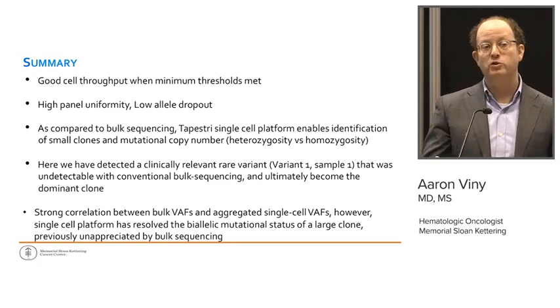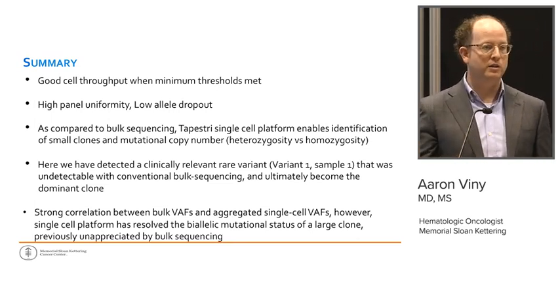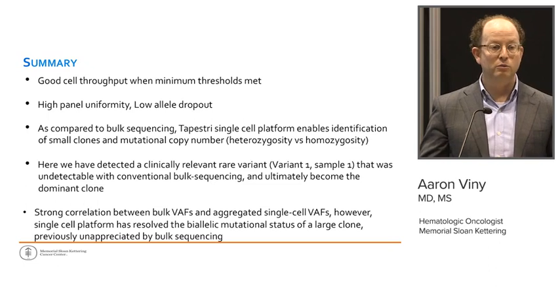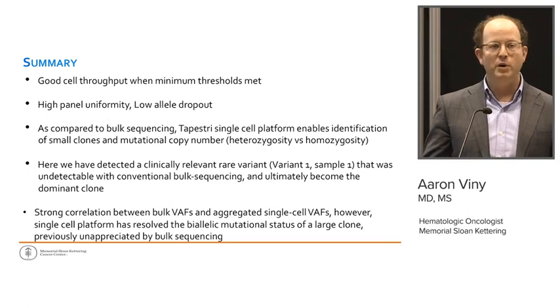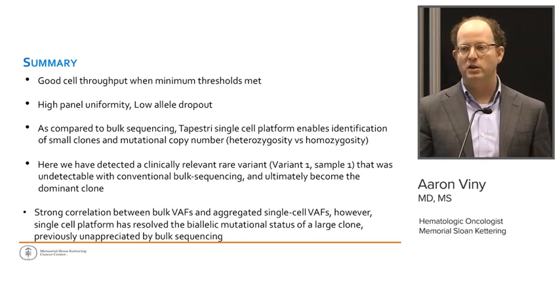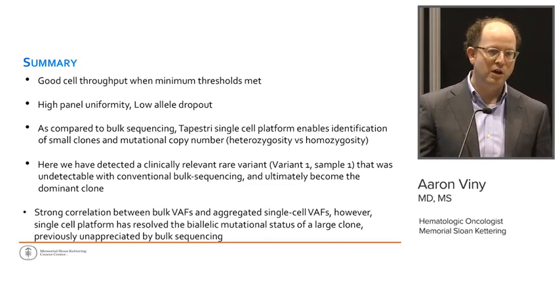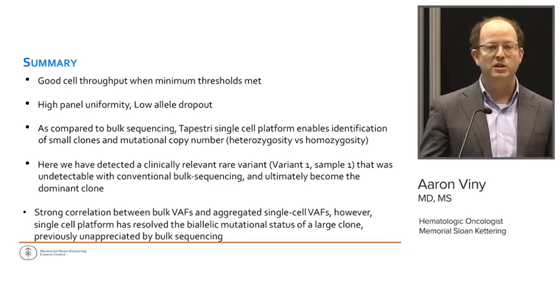So we also had a very strong correlation between our variant allele frequencies and what the Tapestri was able to detect. I think really just confirming that bulk sequencing is really quite adept at identifying large dominant clones. But if you were in Irv Weissman's talk yesterday, he charges that we spend too much money studying bulk tumor and not really understanding the drivers of these leukemias. And so if we want to get at the roots of treating leukemia, I think this is the technology that's really going to help us do that. And I'll be happy to take any questions.